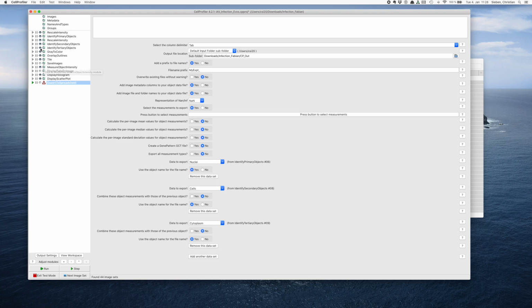It seems to be okay. So first of all, we exit the test mode. And then we don't want to see all of these images during the processing. I don't know how many fields of view I have in here, but we don't want to see like 100 images popping up, and it would also make the pipeline run slower. We don't need these display options either. The rest of them we can keep on.